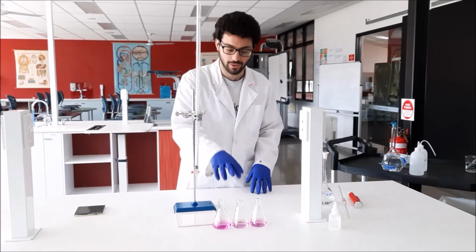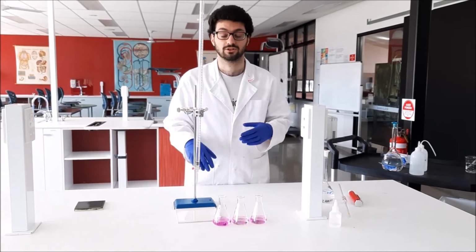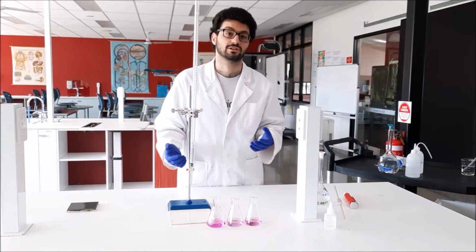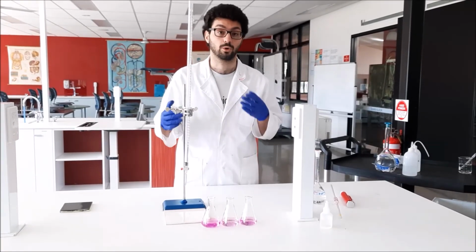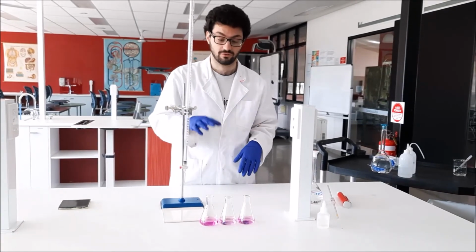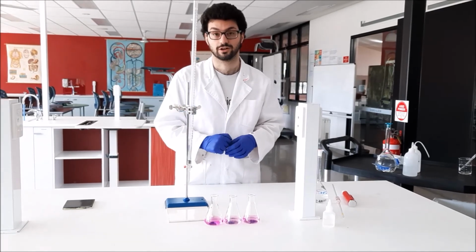Alright guys, so once we've completed our 3 titrations, we then have to do our calculations based on the start and end volume of our burette. So once you do those calculations and you make sure that you've got concurrent results, so remember they're within about 0.1, 0.2 mils of each other, then you can work out the average, and from there you can do calculations to determine the concentration of the hydrochloric acid.